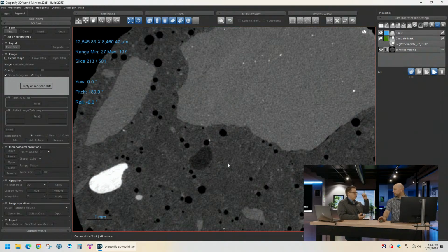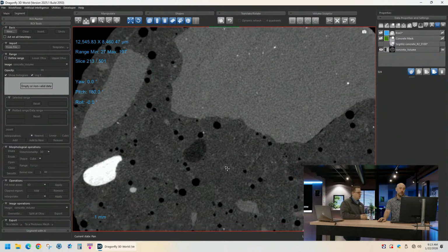And that's where our brains, right? I'm going to drop the word natural intelligence. Our natural intelligence looks at that and goes, I understand that the darkish color, and the darkish color more distributed in the matrix, those are similar colors, but obviously there is one phase that's different.